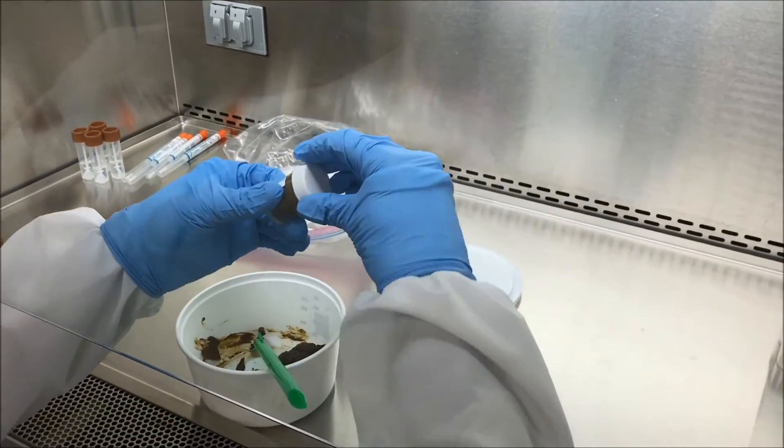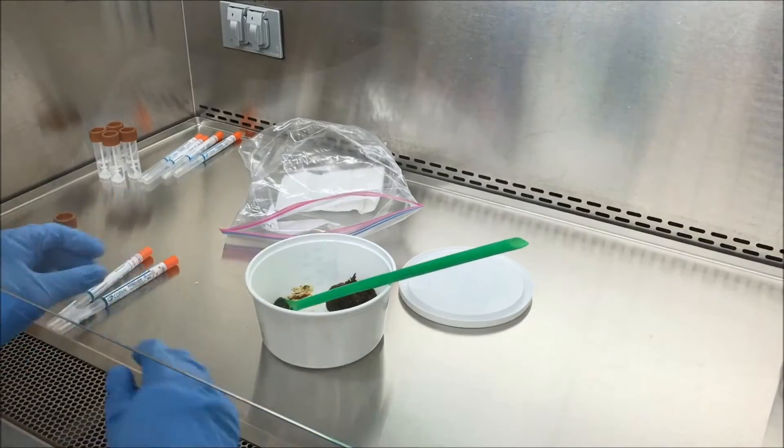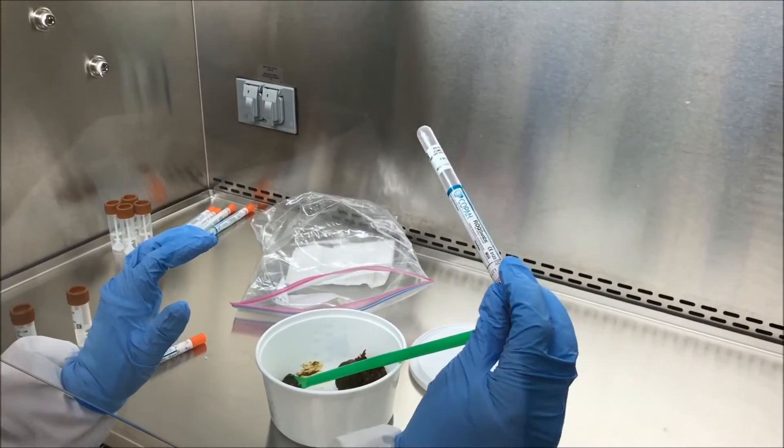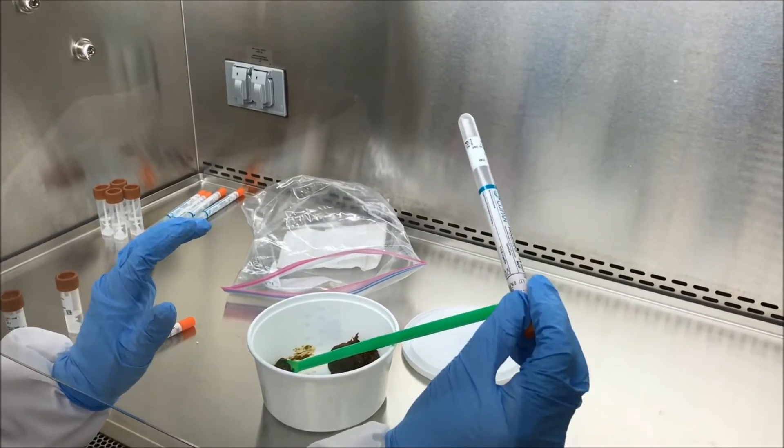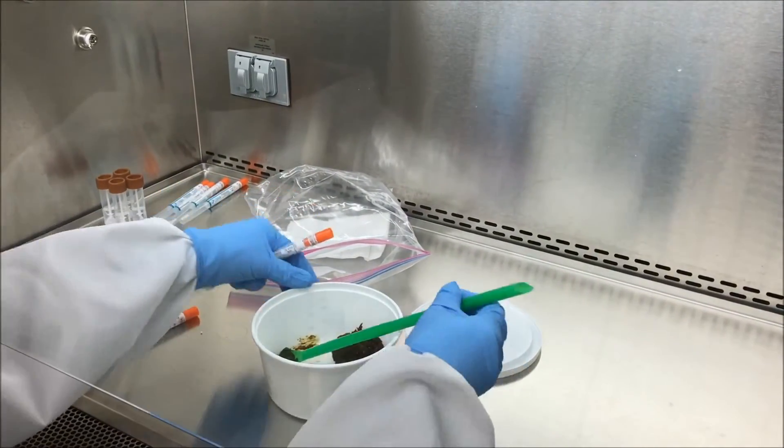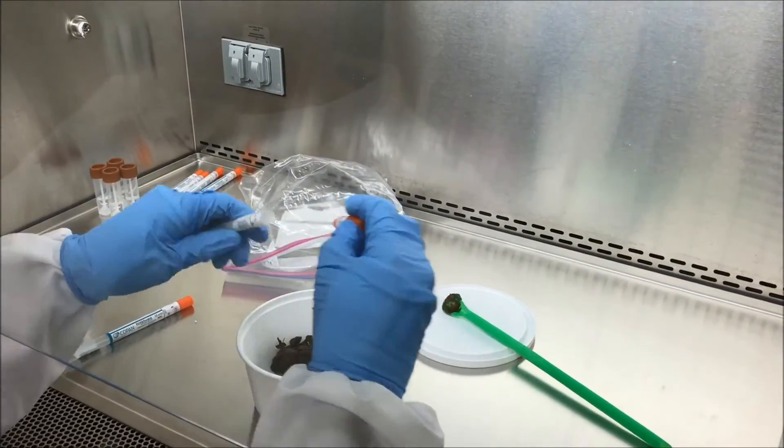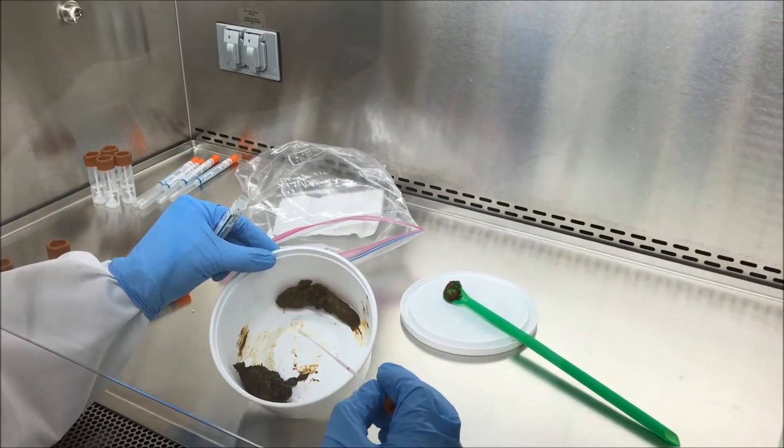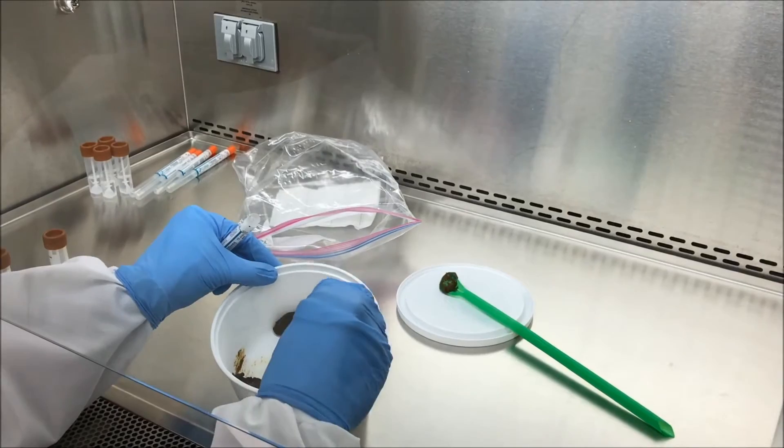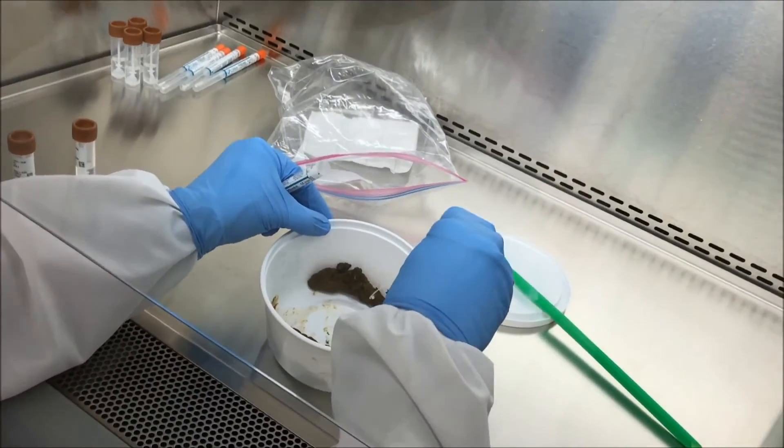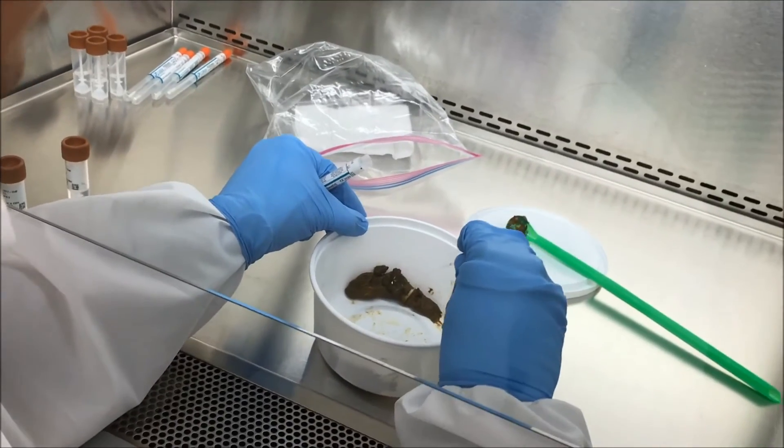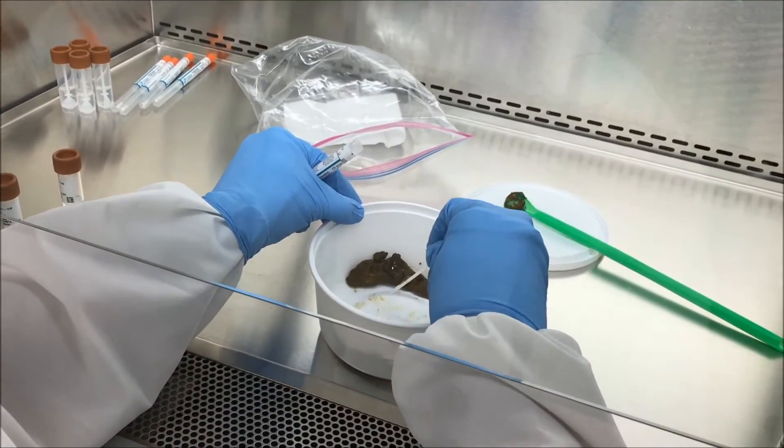So once that's finished, we take our swabs. These are the swabs that we use for DNA extraction in our microbiome analyses. This poop's interesting because half of it's hard and half of it's pretty soft and pliable. We try to go to a good part of it and swab as much stool as we can on the swab as possible.